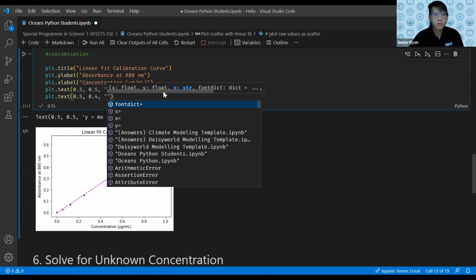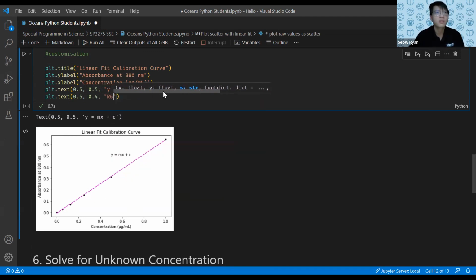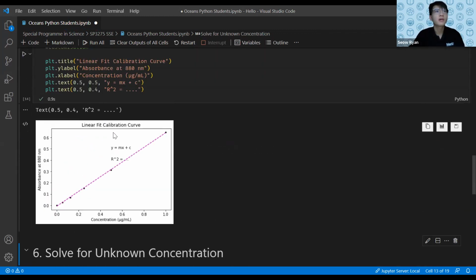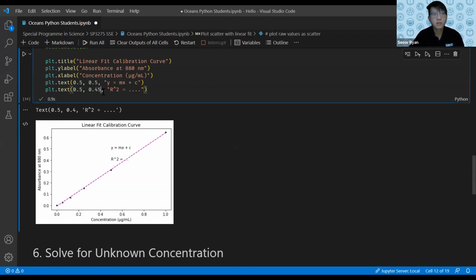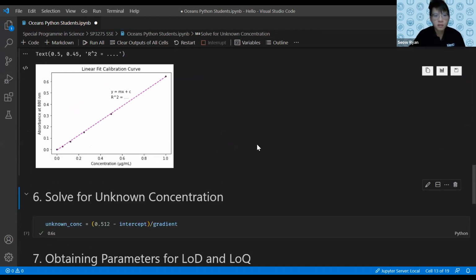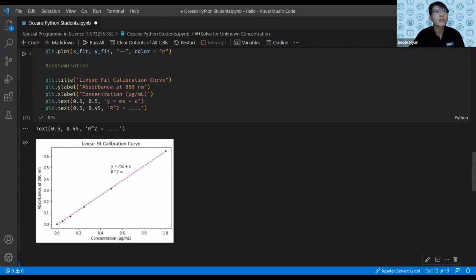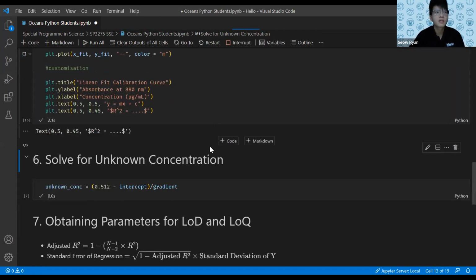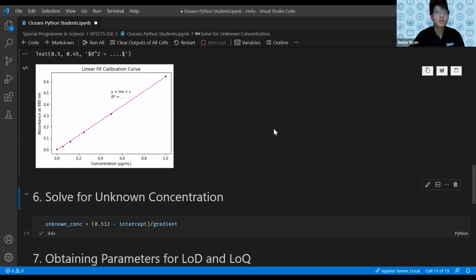And then we put the R square value, maybe R square equals to something, okay, yeah. And then, yeah, so we'll be there, and do the necessary changes, you know. And it's Python, play with whatever you want. If you wanted to make it like more mathematical, you could put the dollar signs. And then yeah, see, it'll become r squared.